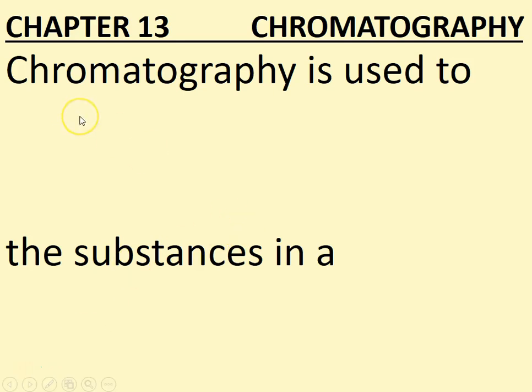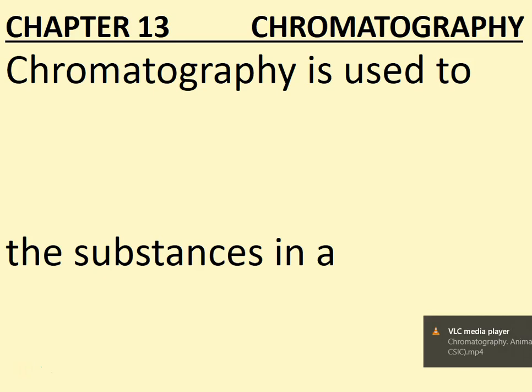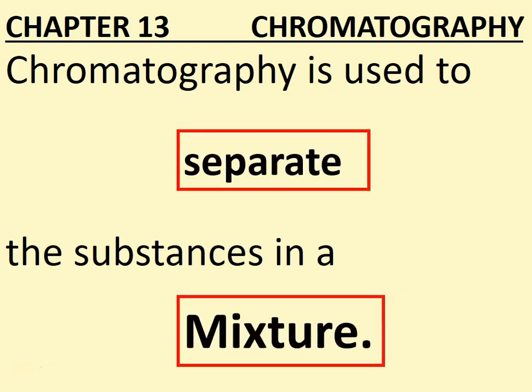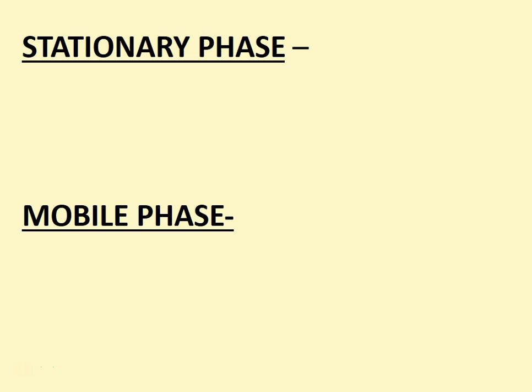So far, the techniques that we've looked at have looked at just one molecule, identifying what the molecule is, but this technique looks at separating the substances in a mixture, so a whole lot of molecules together. You can separate them and analyze them individually, so it's a really powerful technique.